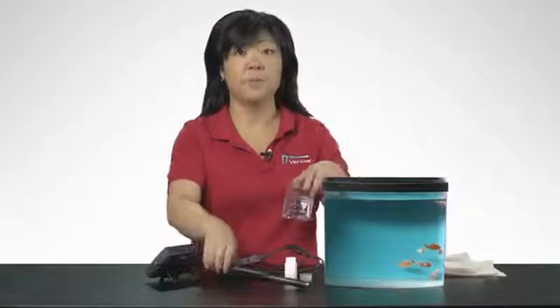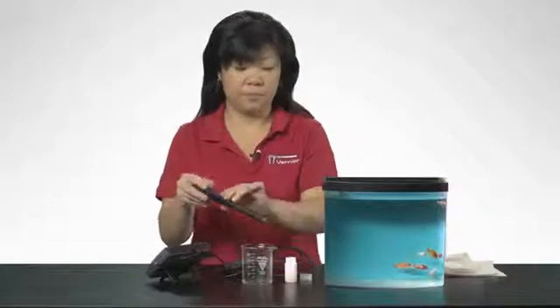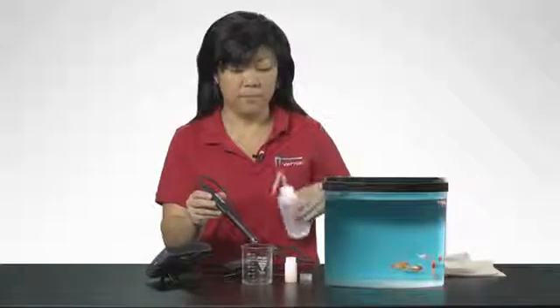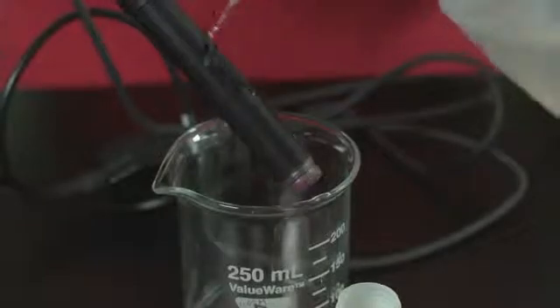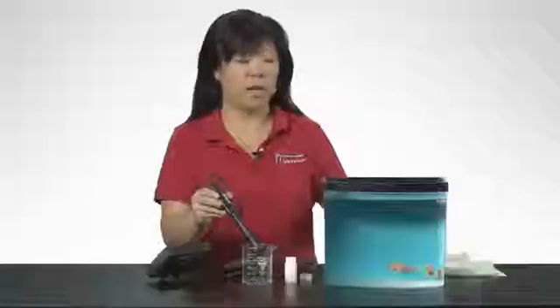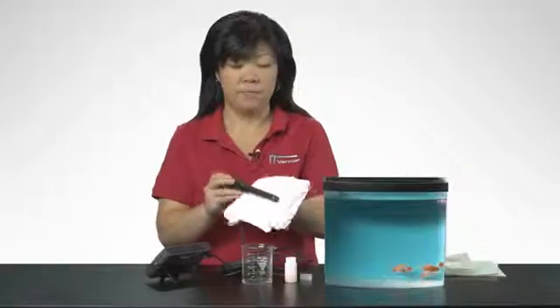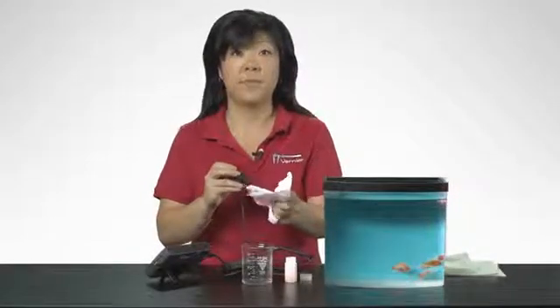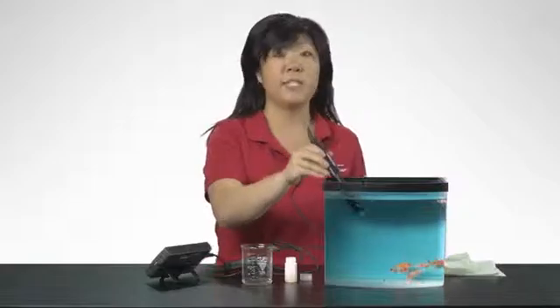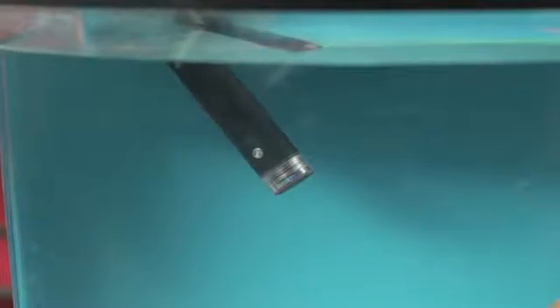To obtain measurements, rinse the tip of the DO probe with distilled water and gently blot dry with a paper towel. Place the probe into the sample to be tested. Make sure that metal dot near the tip of the optical DO probe is immersed for temperature compensation to work.